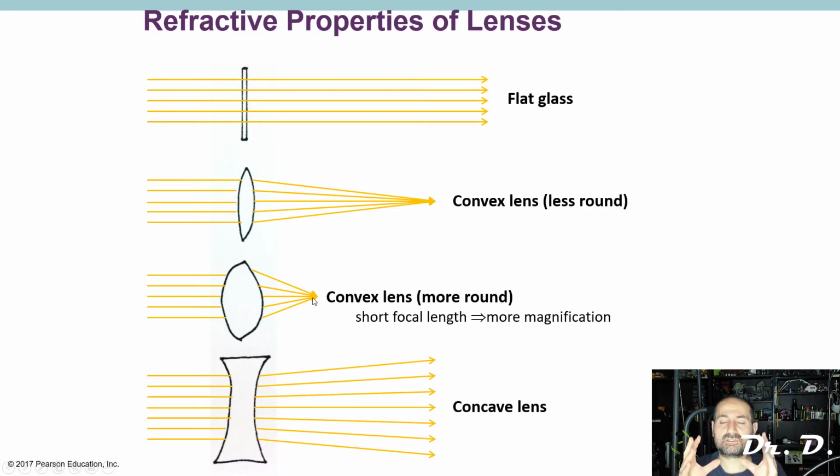If you've ever noticed with the microscope, let me tell you something. With the microscope, if you're on the 4x objective, the objective lens is quite far from your specimen, right? But when you switch to the 10x objective, did that objective get closer to the specimen or further away? It got closer, right? Why is that? Well, because the 10x lens is thicker, so it's going to have a closer focal point, and it's going to be closer to the specimen.